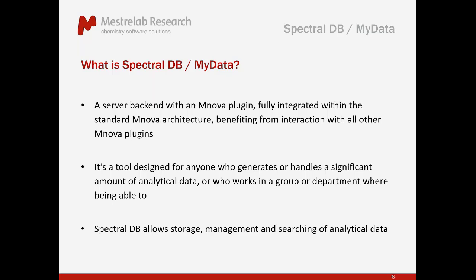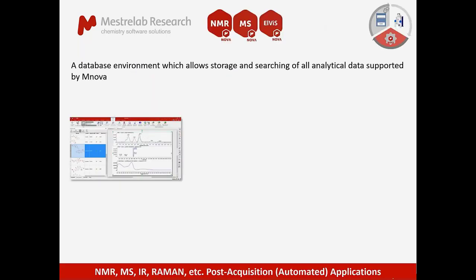The tool is designed really to help anybody who generates or handles a significant amount of analytical data, or anybody who works in a group or a department where being able to share data between people is important. And finally, it allows the storage, management, and searching of all the analytical data.